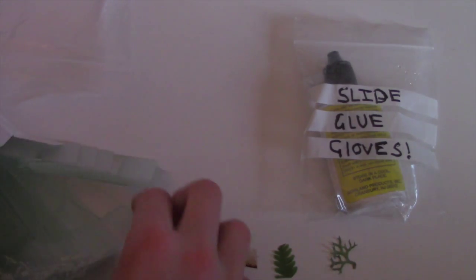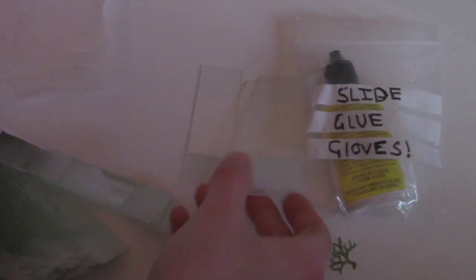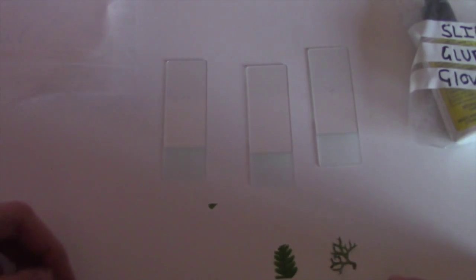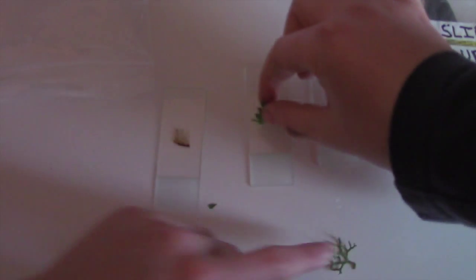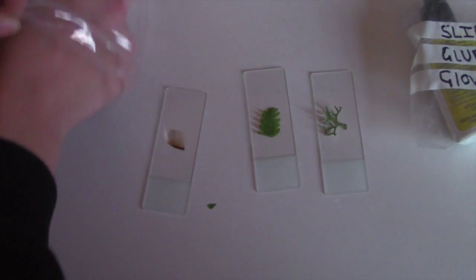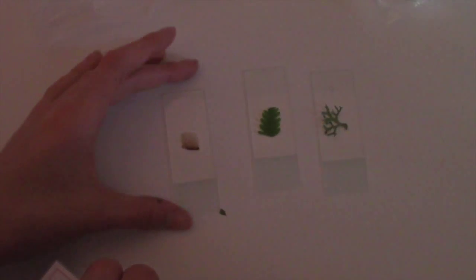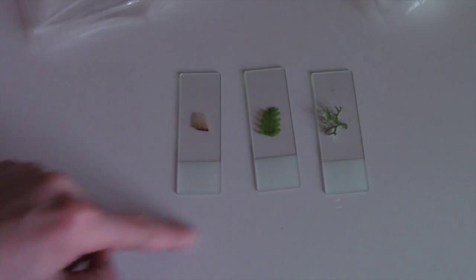We spread the slides out and then place the specimen centrally in the middle. We put the piece of algae on, and then we get the slide covers. Should I get the glue out? No, because it's toxic — everyone needs to put gloves on first. If you're doing this at home, you can buy slides on Amazon, though the quality isn't great.